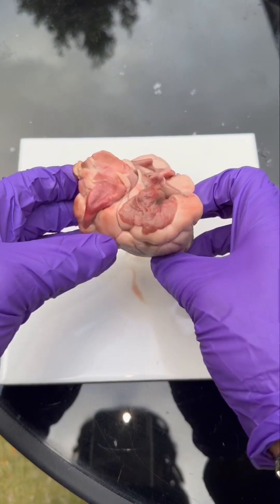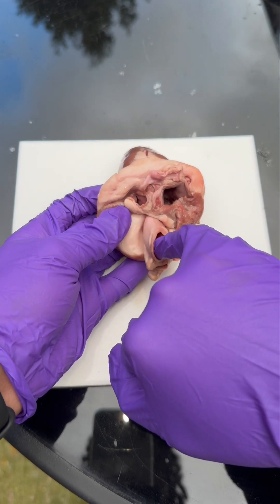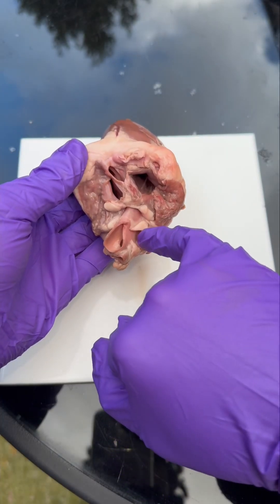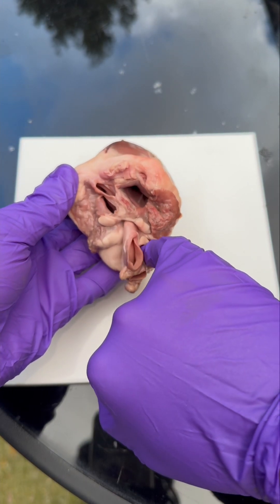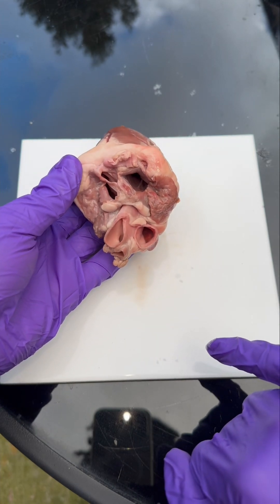The first thing that we notice is that the heart has four main holes. This one is called the aorta and it carries oxygenated blood around the whole body. It's the thickest one because it carries blood at a high pressure. Just below that we have the pulmonary artery. This carries deoxygenated blood to the lungs to pick up oxygen. Because the blood is travelling a smaller distance, the blood pressure is lower so the walls are much thinner.